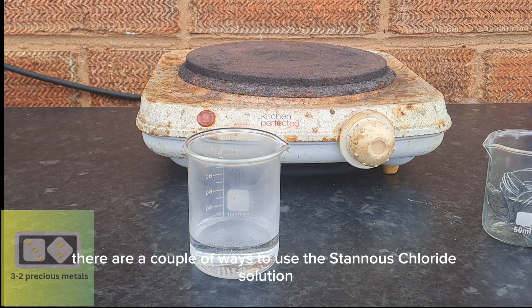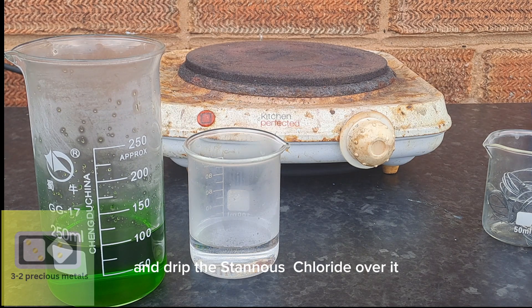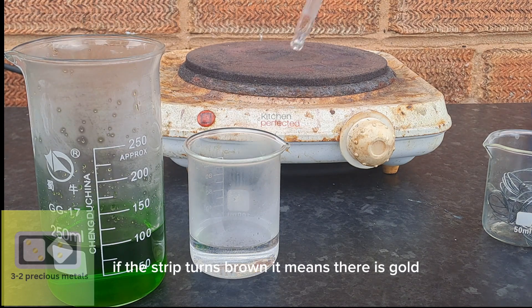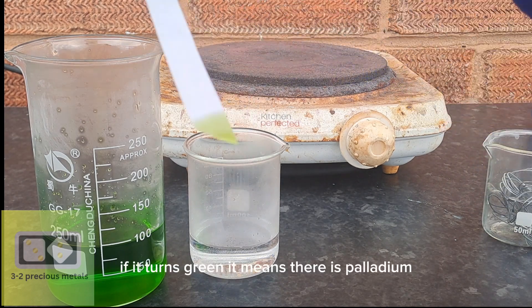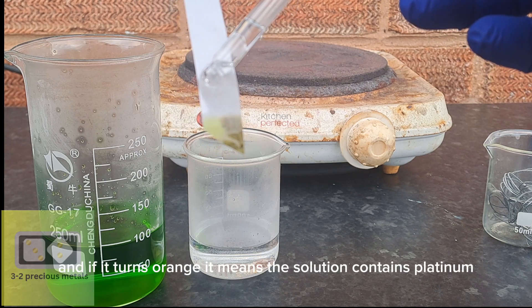There are a couple of ways to use the stannous chloride solution. My favorite is to dip a piece of filter paper into the gold-bearing solution and drip the stannous chloride over it. This also shows if there is any other type of precious metal in the solution. If the strip turns brown, it means there is gold. If it turns green, it means there is palladium. And if it turns orange, it means the solution contains platinum.